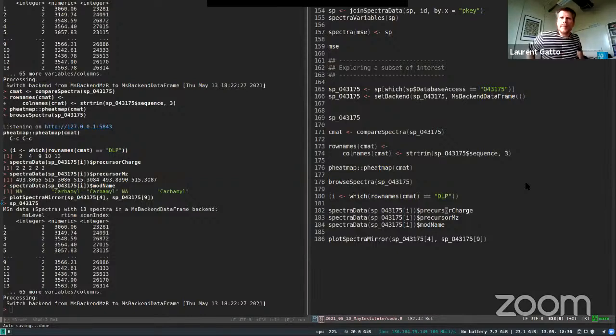And also a really good question here. If the purpose of this tool is to record how MS data is analyzed so that it is reproducible, at what stage should we implement it? Right after searching and identifying proteins or before additional analysis? Also, how can we incorporate other tools like MSstatsTMT into the script? This really depends, what are you aiming for?